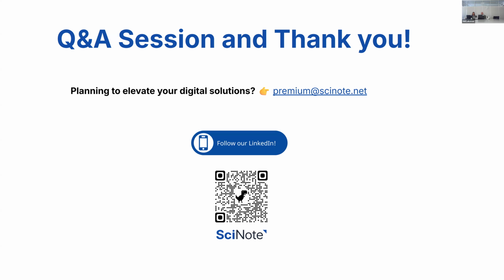but I'm sure somebody from the product team will be mad at me. It's going to be some sort of chat where you're going to be able to create stuff in SciNote quicker, instead of clicking on buttons, actually talking with AI that's going to help you design that specific experiment and protocol. So that's the direction we're currently taking. We are still looking into how specifically to do it with inventories, but most likely something in terms of trends is what will come down the line.